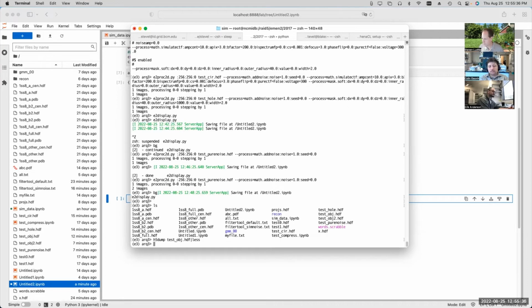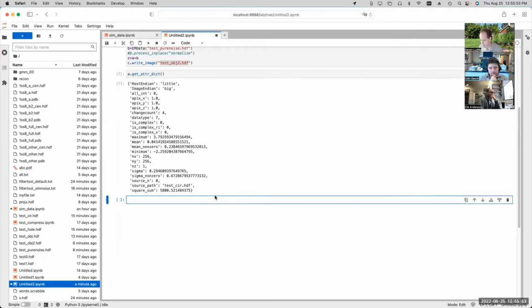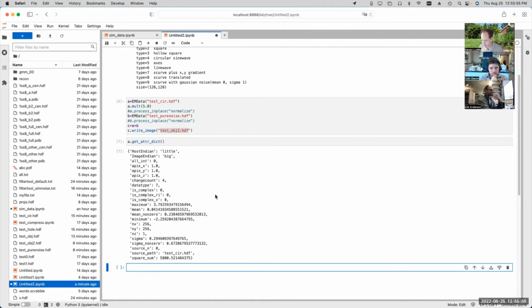However, if you use other HDF5 data saving libraries and stuff, you'll be producing valid HDF5 files, but they won't have the same internal structure as the EMAN produced ones, and then they won't be directly EMAN compatible. So that's sort of the disadvantage. You can have two HDF5 files, and not any program that uses HDF will necessarily be able to read them.